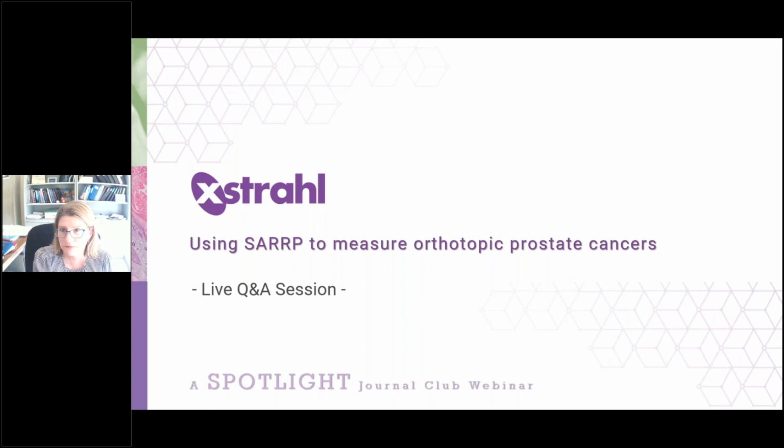Next one. How do you measure the sizes of the tumors ex vivo? Is it also by only measuring lengths and widths? Yes. So we just measured length and width. The longest measurement lengthwise and widthwise is how we measure those tumors with the calipers. Okay.